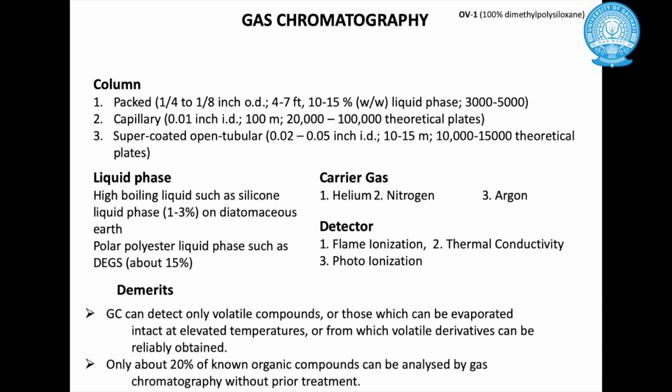A mass spectrometer measures the mass of the compound eluting from the column. The phenomenon or the process involved in measuring the mass of the eluting compound is almost the same as that of LCMS.